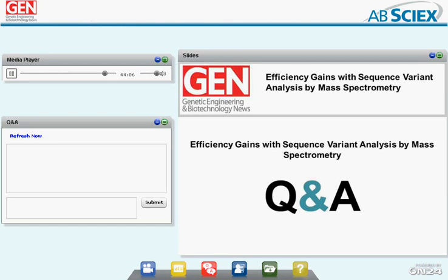Okay. And Jason, another question. Do you know if the CDR hypervariable regions show a higher tendency for somatic mutations? It seems to depend on the different germ lines that are used, but you do see a higher percentage of somatic mutations in the hypervariable CDR regions. We also do see, in cases like looking at the Waters intact mass standard, you also see these somatic mutations in even the conserved regions, which may be just differences in the different animals used.